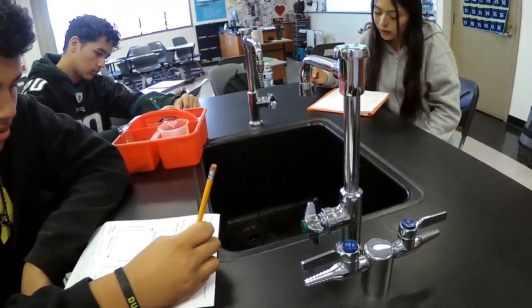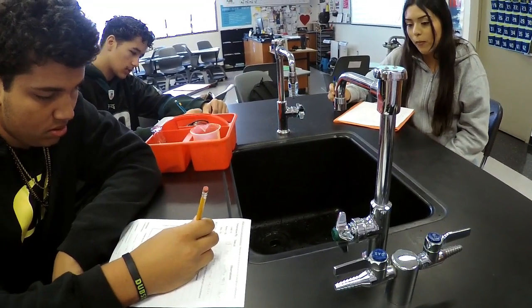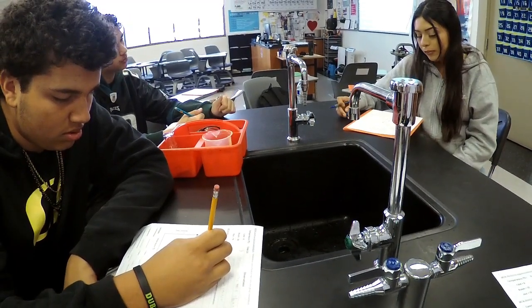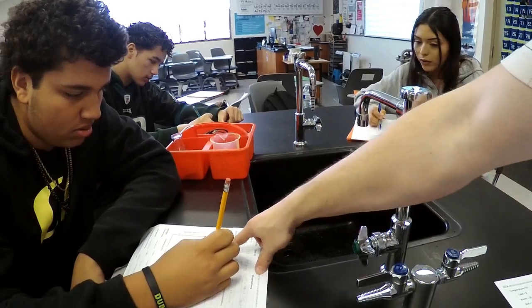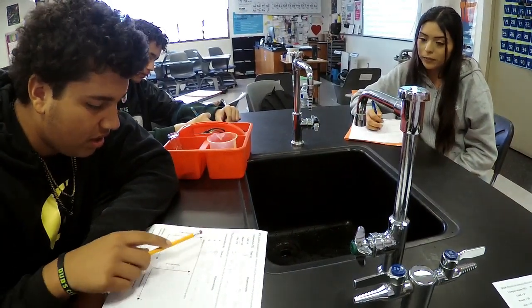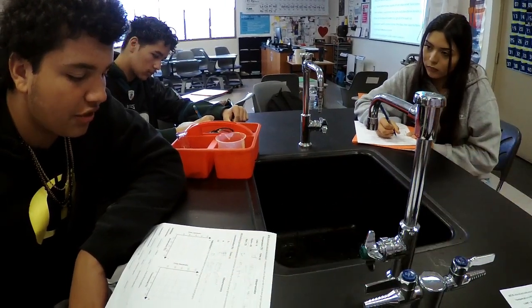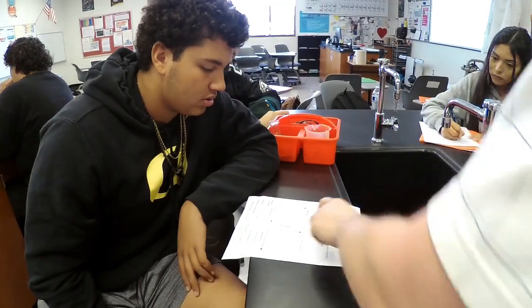I got 46 seconds, and it was moving fast. So you got, which one was it? 46, yeah. And what was the time for 3%? Observation was moving fast. 155 seconds. Is it 55 or 155? 155. 155, okay. So are we starting to pick up on any trends that are happening here?